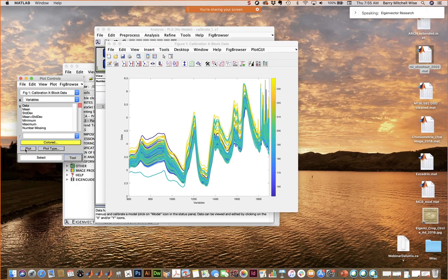You can also use some of our cluster analysis methods to automatically assign classes to it. If you have the class information available with part of your samples, you can load it into the data sets, and you don't have to do it by hand. You can read the files in. So that's 3 ways that can speed setting classes up on large data sets.